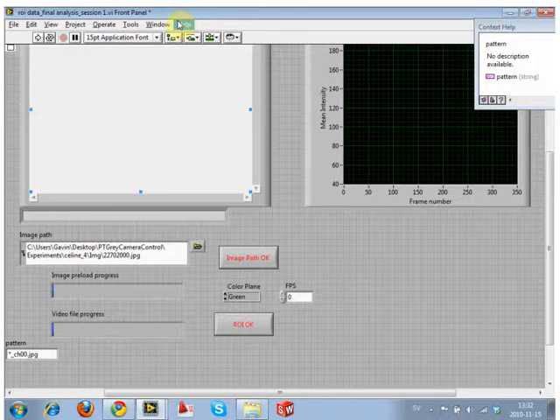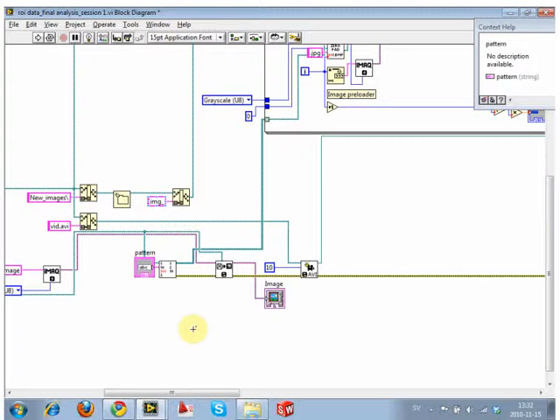But a lot of times you don't actually need all of this stuff. What you actually just want to say is this: you want all the files that are JPEGs. Because it's quite common that you need all of the files, but you don't want the text files and the other unnecessary files, like program files, LLB files, for example. So by choosing one of the images, we're already telling it we want JPEG files. So we can add that into this, so we don't have to keep this pattern function.